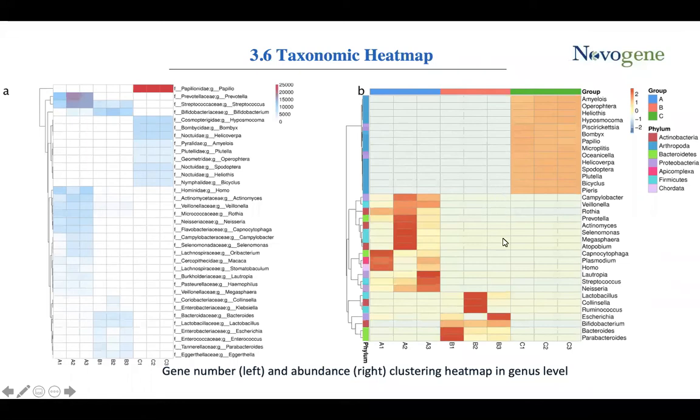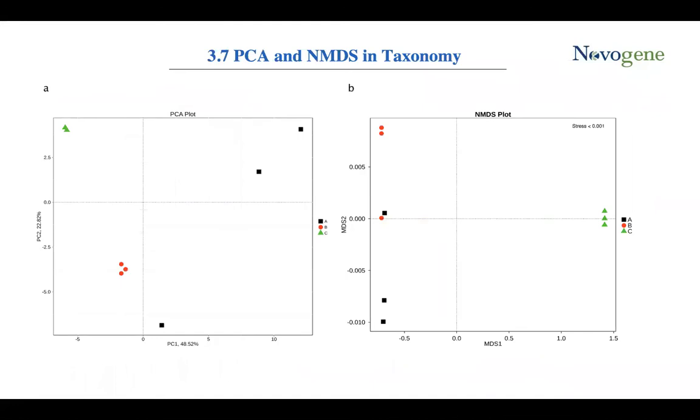It is plotted with sample name on the x-axis, and the y-axis represents the genus. The absolute value of z here represents the distance between the raw score and the mean, in units of the standard deviation. So the redder the color, the more this phylum is clustered in this sample, and vice versa.